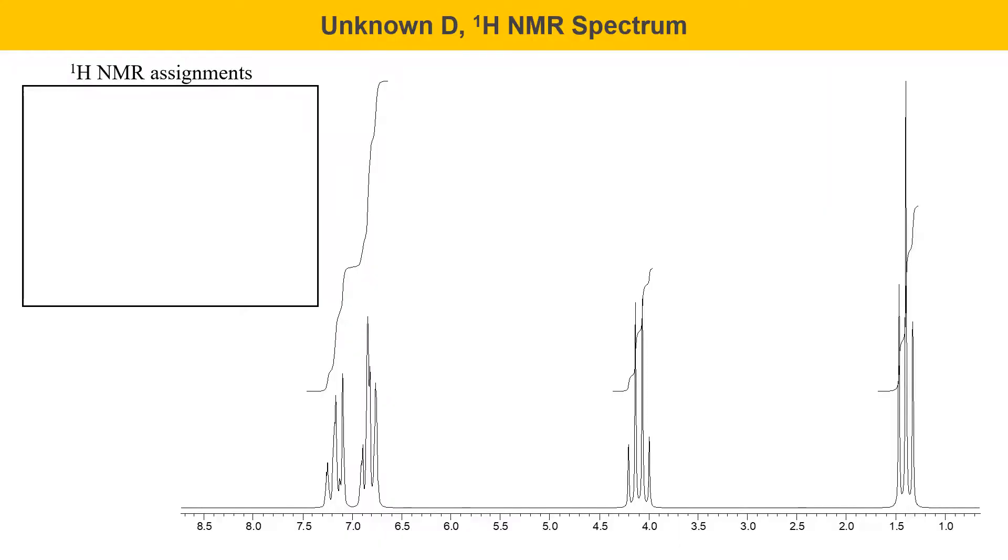Here's the proton NMR spectrum of unknown D. One thing I want to point out here is that there's a signal at about 7.0 that is a complicated multiplet. Complicated multiplets like this can't be analyzed using the n plus 1 rule. If you look at this multiplet, it's quite a bit different than the others that we've seen that have been split into nice symmetrical groups of peaks, like triplets and quartets and doublets. This has got a very irregular pattern to it. When you see a multiplet like this that has no symmetry to it, that's kind of very complicated looking, that arises from complicated splitting that isn't easy to analyze. You can still get the chemical shift information out of this signal. You can still get the integration information out of this signal, but you can't get any splitting information out of this signal. So don't try to do that. Don't try to assign this as a doublet, a quartet, because it's not appropriate here. If you try to do that, you'll be confused.